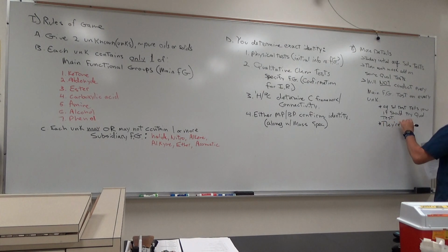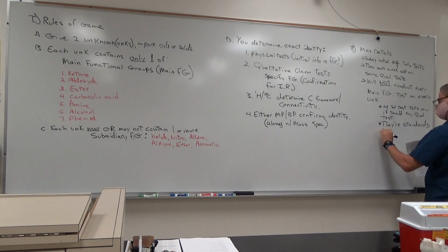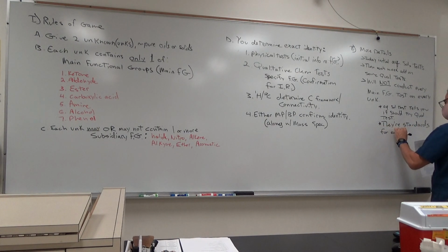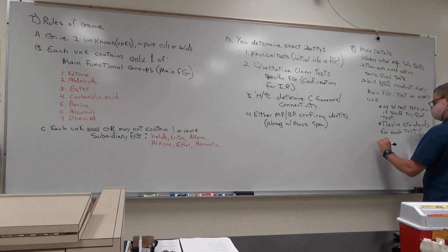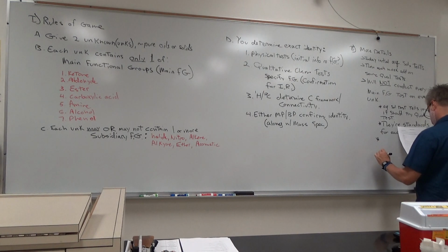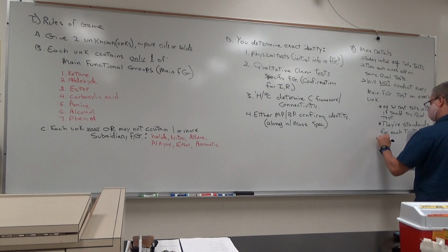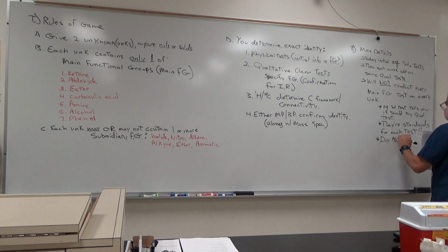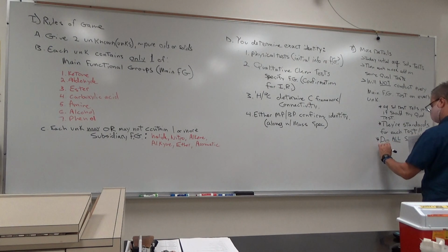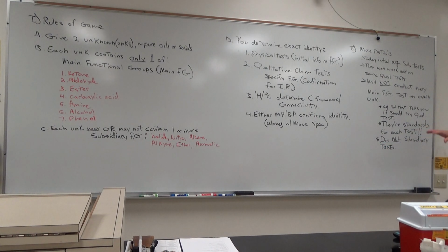There are standards for each test. Do them. Do all subsidiary tests, because of the rules of the game.